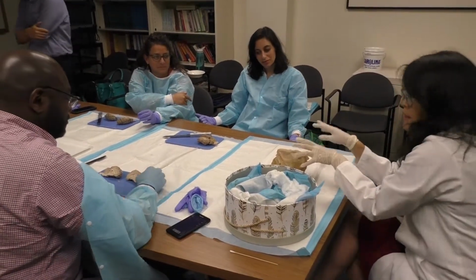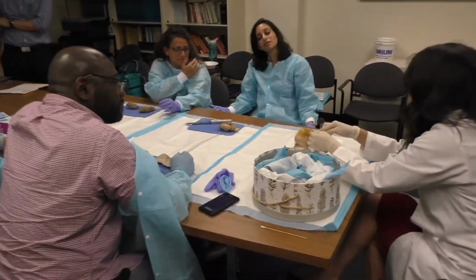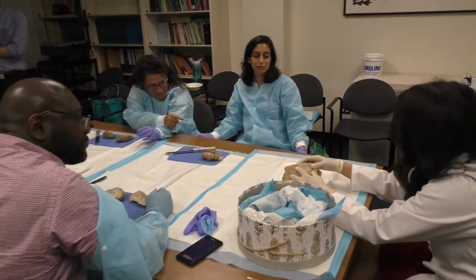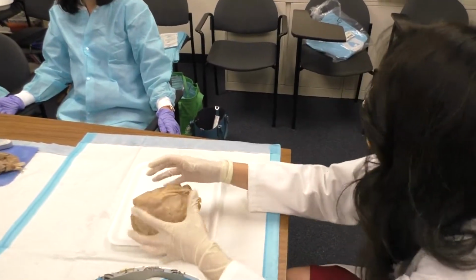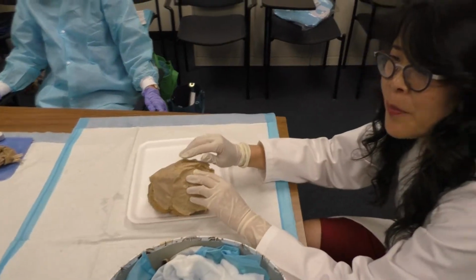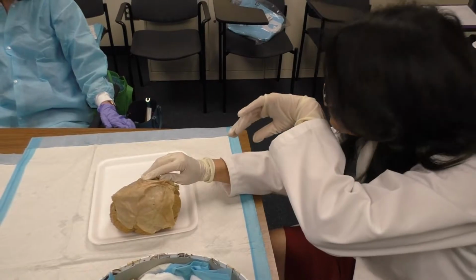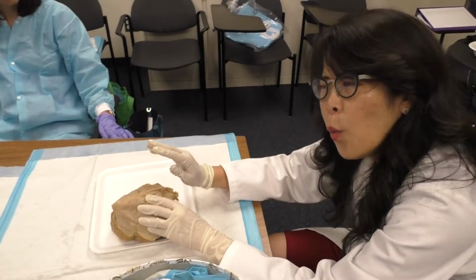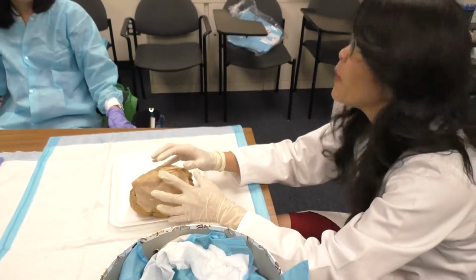So all that CSF that gets created in the lateral ventricles goes down. It exits through these particular holes, and that's how it gets in this area right here. And so this protection is kind of like a waterbed for the brain. And the way that I like to illustrate it in class, that I think might work really well for you guys, is to ask the students, what food stuff that you can buy in the supermarket does this remind you of?